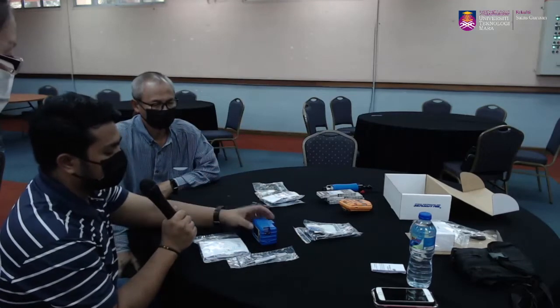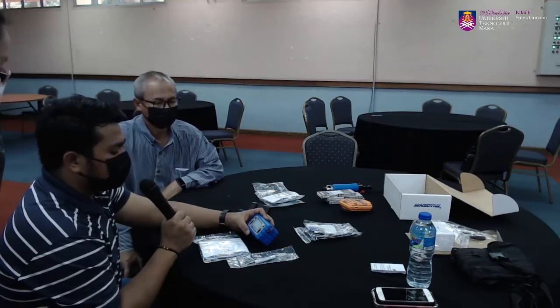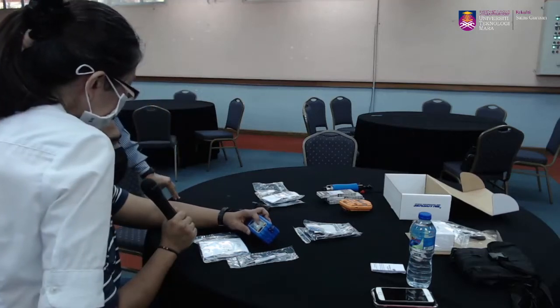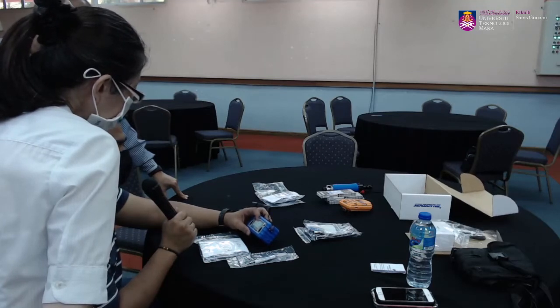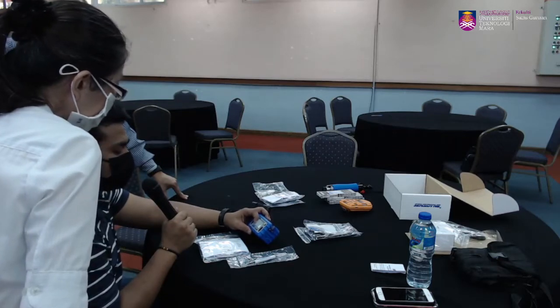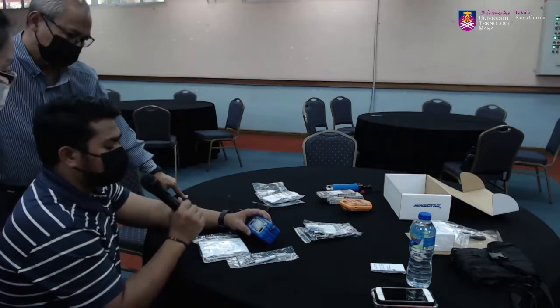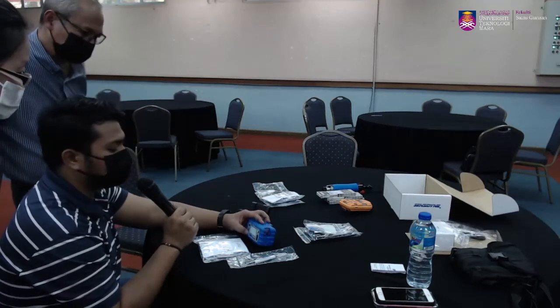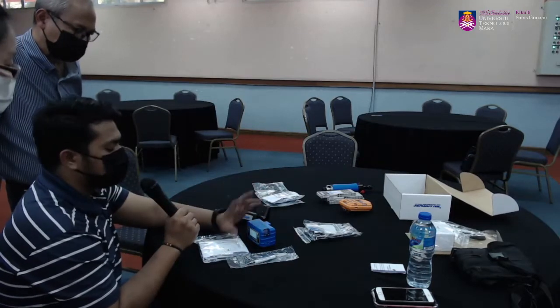Okay, so from here we can see that we have started from earlier, and it can show the total runtime we have run is about 6 minutes. It gives the general information so far, in terms of the volume it has used, the back pressure, and the expected runtime, the probability of the runtime being 5 hours plus. That depends on the battery. If we are fully charged, it will be higher. And it depends on the flow rate: if the flow rate is low, usually it will last longer. So that is usually the case.